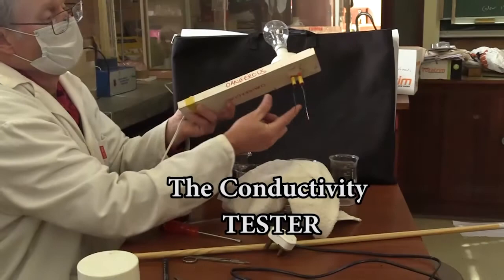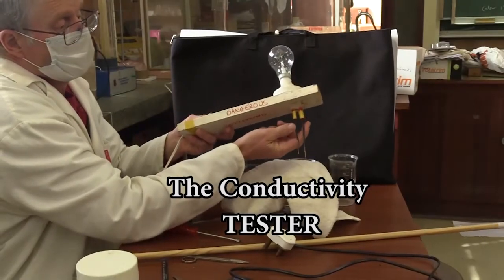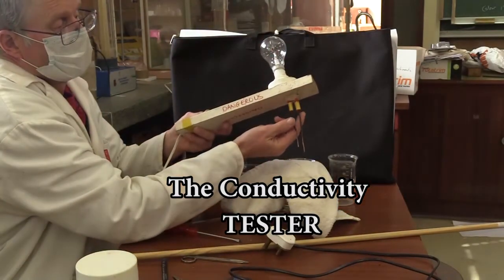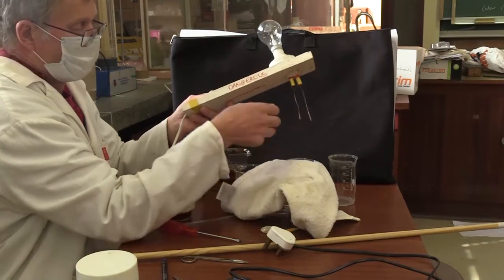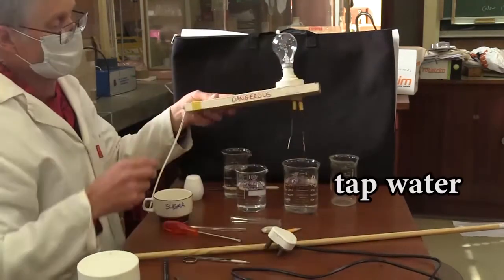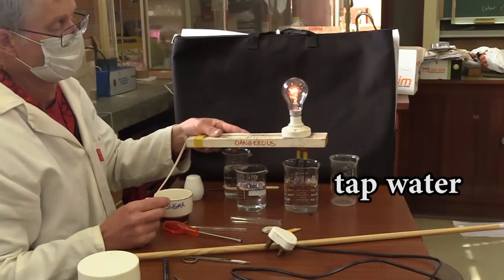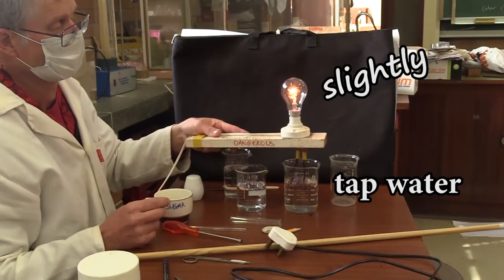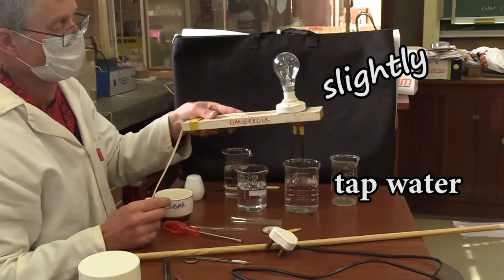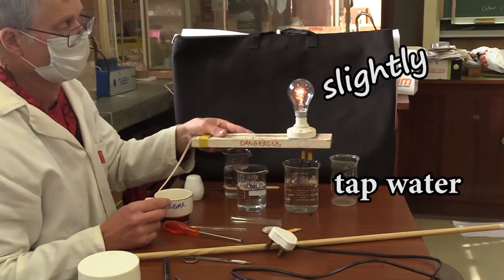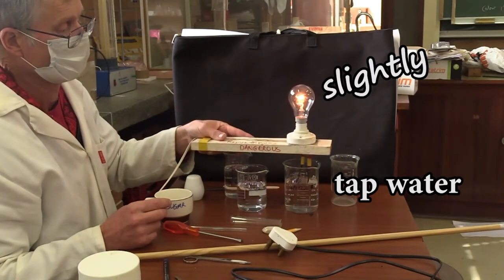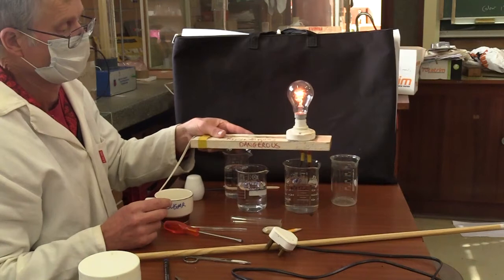So here's my conductivity tester. When you touch the terminals, we'll bridge it with a conductor when the bulb glows. Here's some tap water. As we push it in deeper, you see it conducts slightly. That's because tap water has a very low concentration of salts dissolved in it.